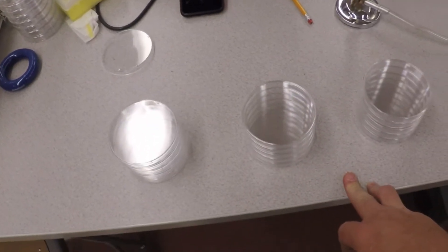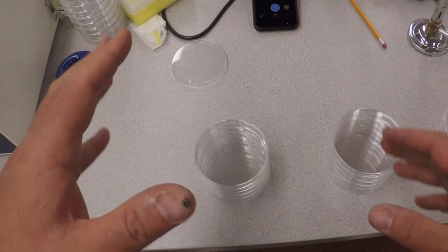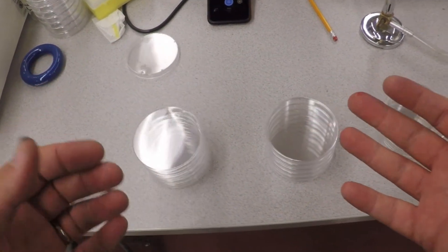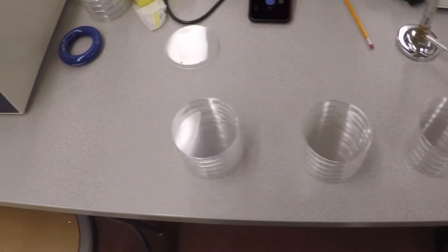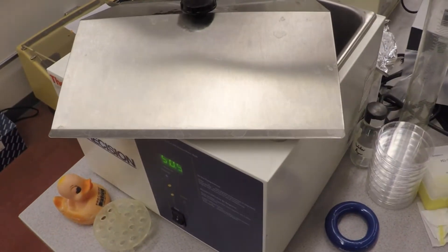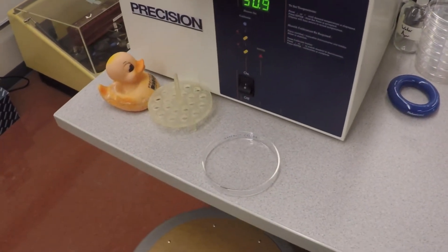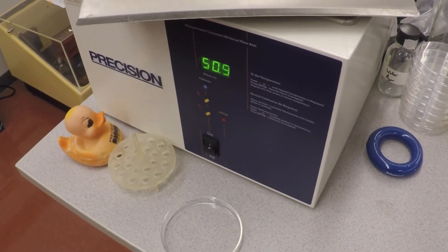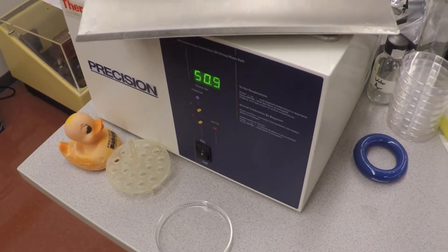Okay, as promised, we're going to pour some plates. I took the McConkey's agar out of the autoclave—it was very hot—and brought it over to this water bath. I set the water bath to about 50°C. Agar will solidify at about 48°C, so it's been sitting in here for a little while and now I can pick it up, which is handy.